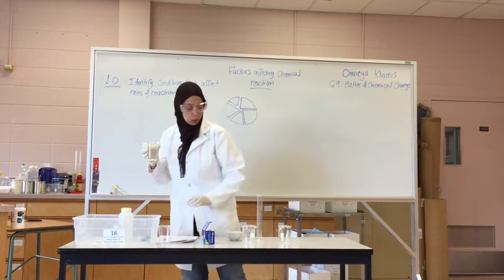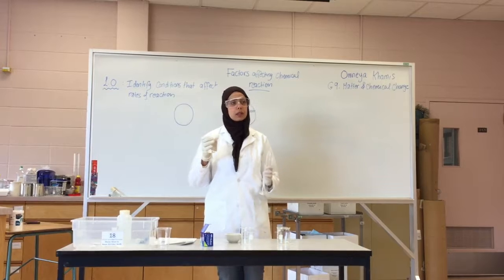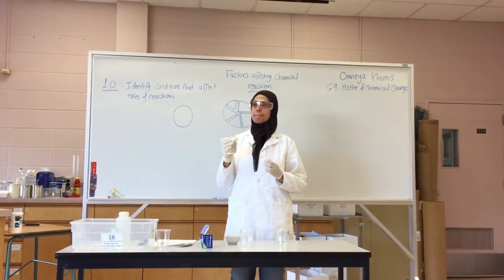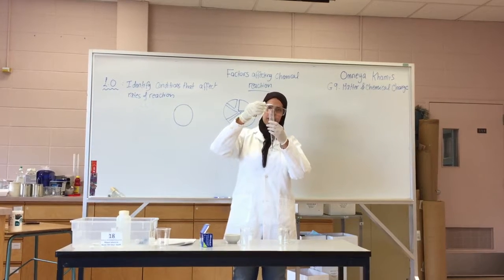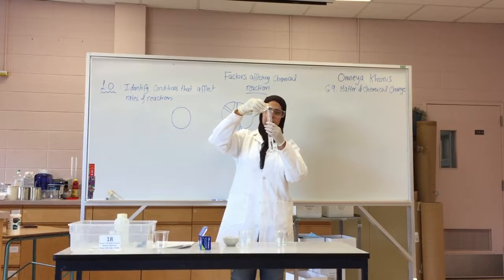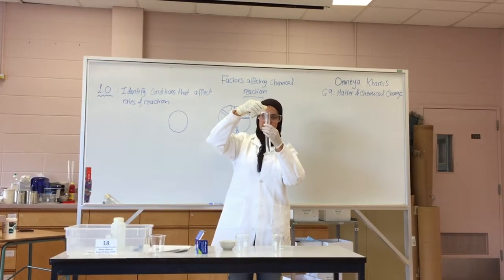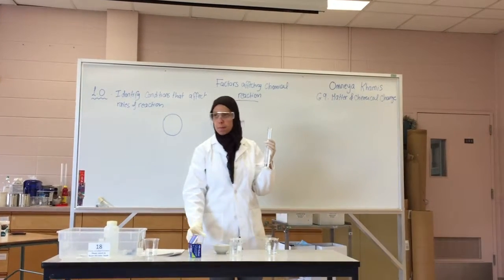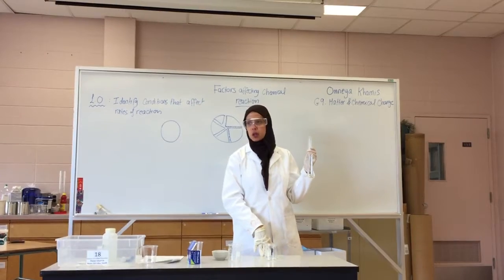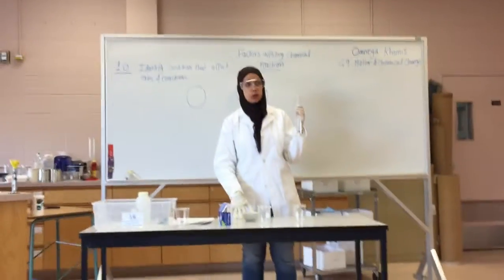While I'm doing so, is it important to have the same volume of water in the two beakers? Yes. Why do you think so? So that they're in the same reaction conditions. Yes, and what else? What am I changing here in my reaction? Surface area. I'm changing the form of the tablet. So one is a whole tablet, another one is crushed, right? So I'm changing now the form.